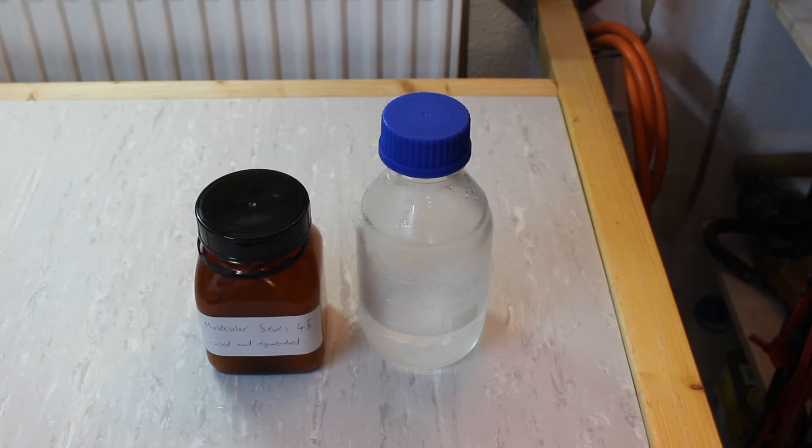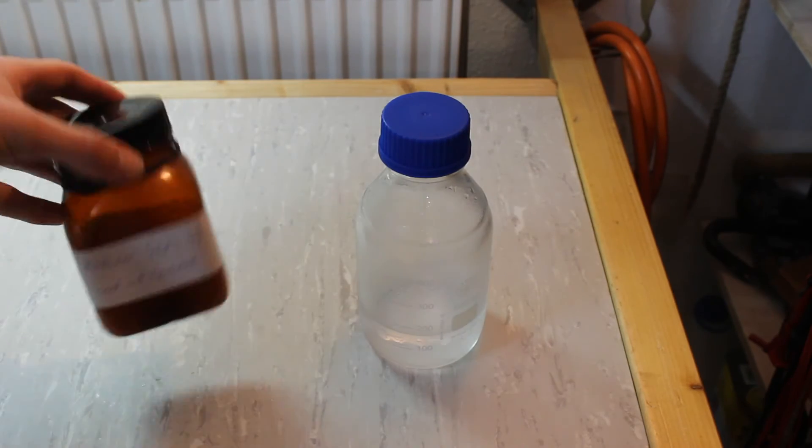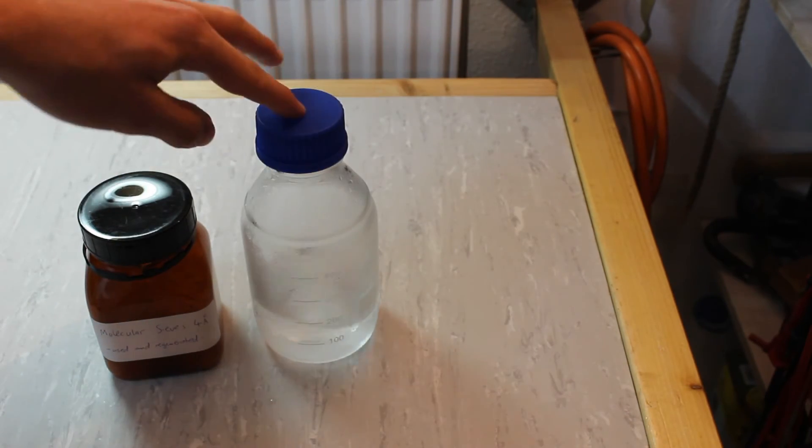Actually drying the ether is very easy and we simply have to add some molecular sieves into our ether. One thing to note is that you might want to chill your ether beforehand since the absorption of water by the molecular sieves is exothermic. So without further ado, let's just put an arbitrary amount of molecular sieves into this diethyl ether.